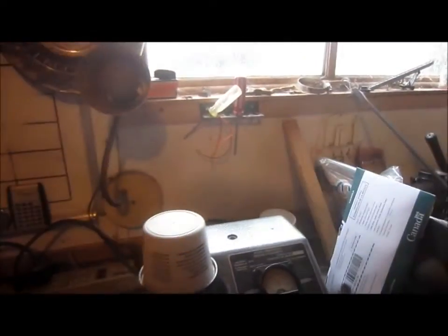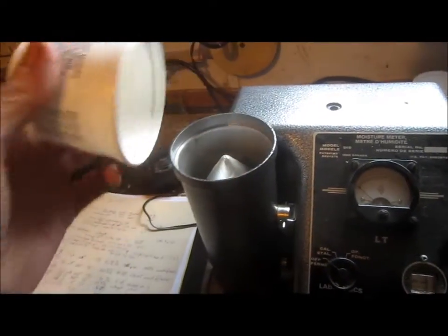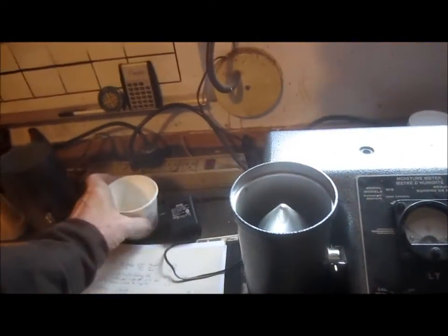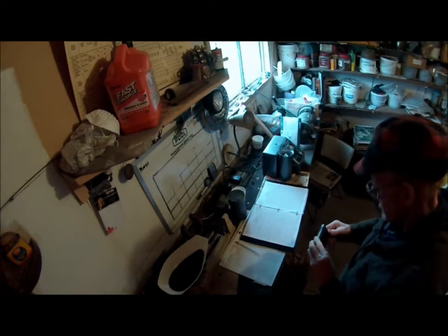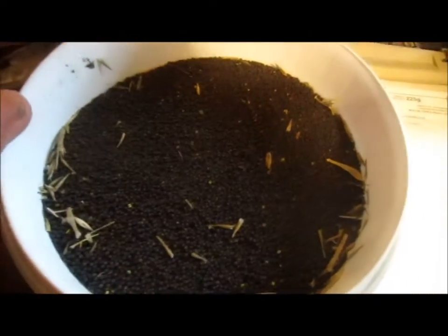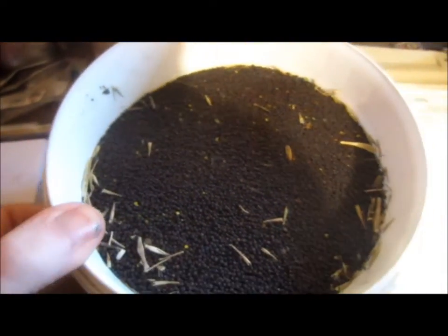It's raining out there today, so obviously no harvesting. I thought I'd do a brief video clip showing how we test the moisture content of the grain. Grain has to be harvested at a safe level of moisture unless you're planning to dry it.